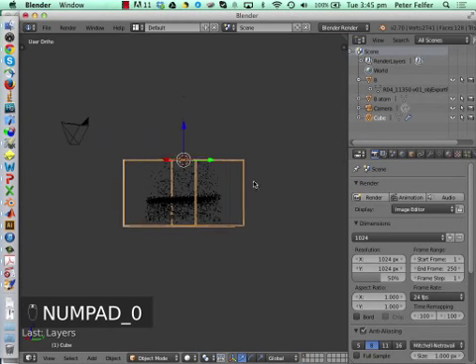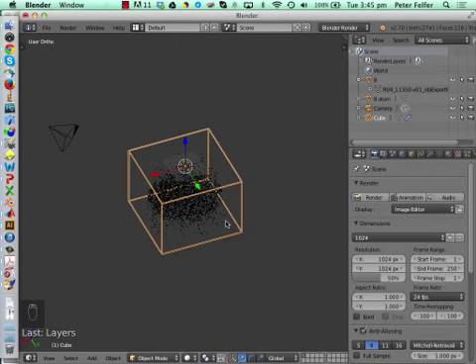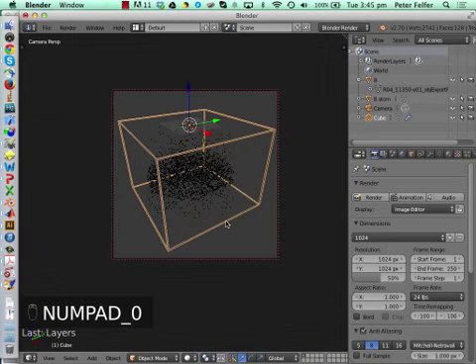So we've already gotten, in terms of visualizing your data for a publication, most of what you need. And the next thing that you would actually need is animation. So trying to animate what you do.